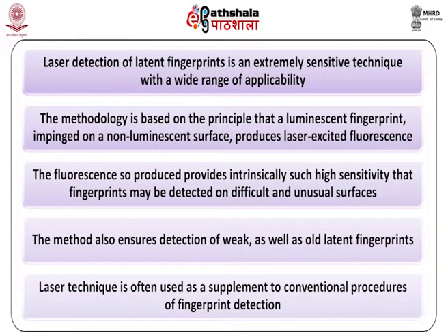You know, laser detection of latent fingerprints is an extremely sensitive technique with a wide range of applicability. The methodology is based on the principle that a luminescent fingerprint impinged on a nonluminescent surface produces laser excited fluorescence. The fluorescence so produced provides intrinsically such high sensitivity that fingerprints may be detected on difficult and unusual surfaces. The method also ensures detection of weak as well as old latent fingerprints.